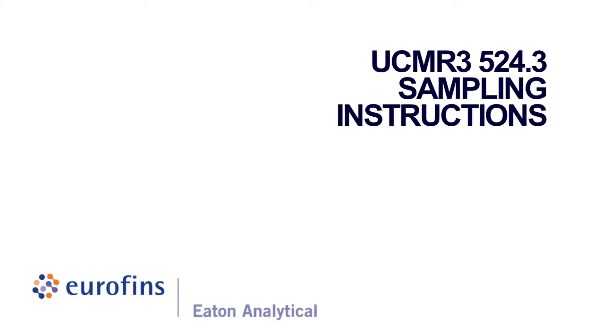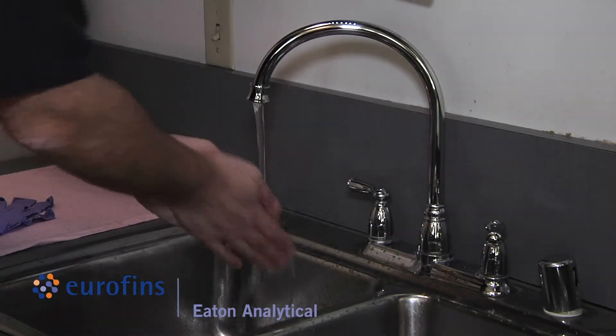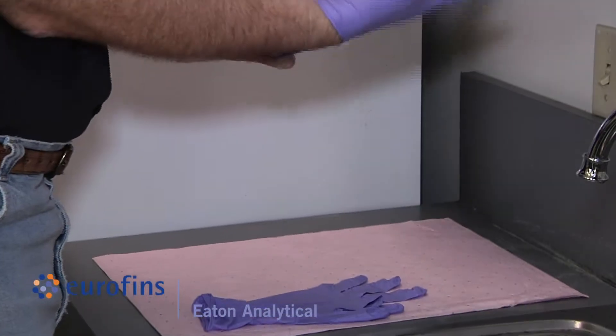UCMR3 524.3 sampling instructions. Wash your hands before sampling and wear the powderless nitrile gloves which are included in the kit during sampling and sample handling.